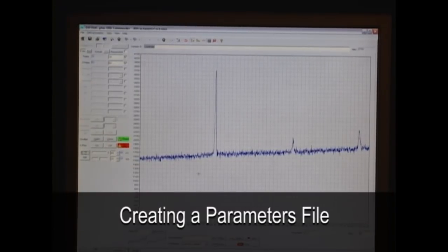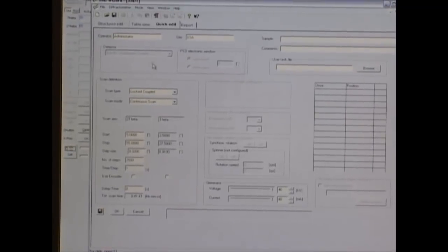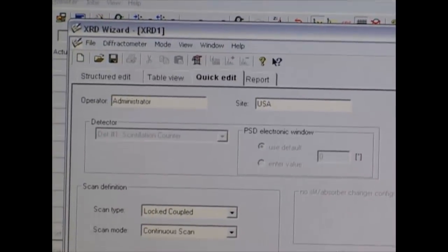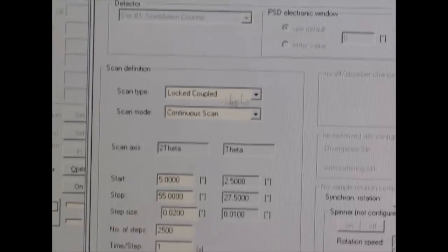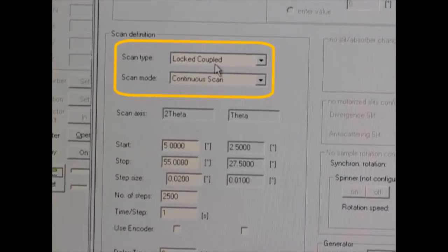The way to set up a parameters file is in a separate application and the link to it is on the toolbar down here and it's called Xperia. When you open up the wizard, you get the quick wizard page, which is fine. The only thing that you really care about is putting your name in here and determining your scan definition and verifying your generator voltage and current is what you want.